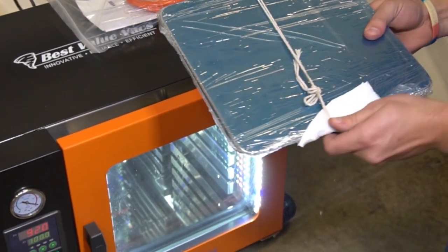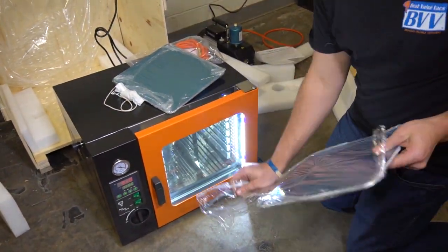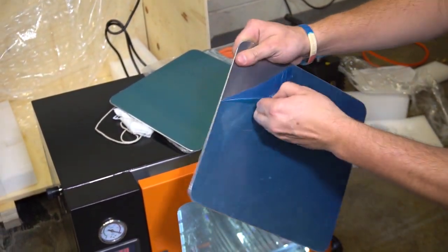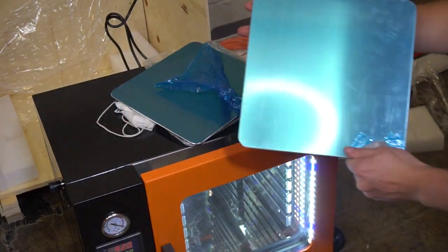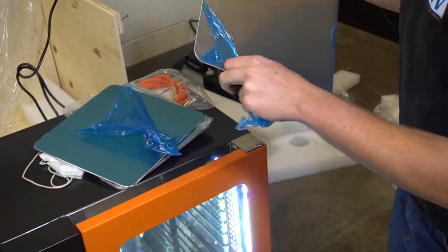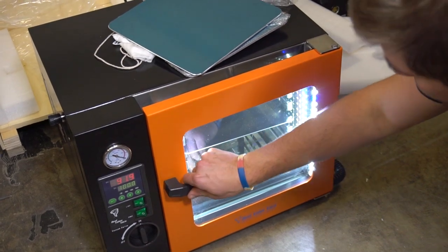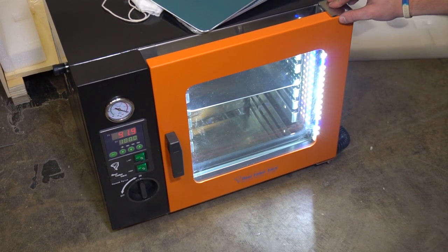Now we can start fitting our shelves in the oven. The shelves do come with a blue protective coating — you're going to want to take that off before using them. They pull off nice and easy, giving you a nice shiny surface underneath. Do that for both sides. Once the shelf is ready, open the oven up, slide it in on your shelf brackets, and get your material loaded up. We recommend letting your oven get to temperature before putting any material in, then letting it saturate for up to two hours to make sure heat is evenly distributed throughout the whole oven.